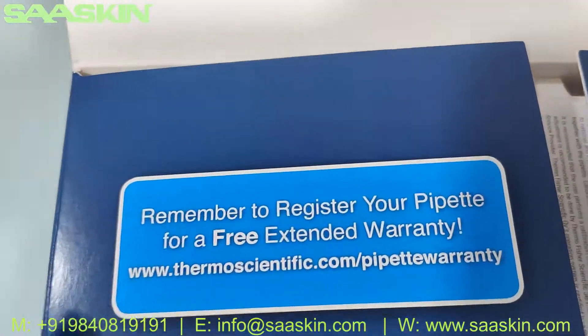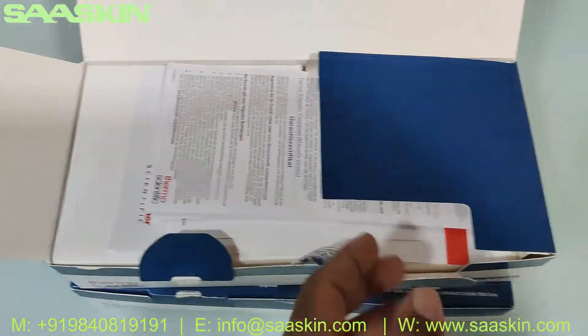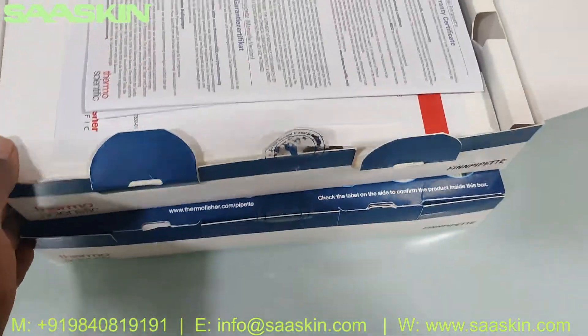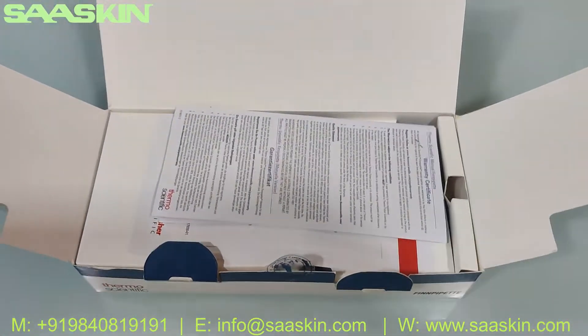It says: remember to register your pipette for a free extended warranty. When you receive this product, make sure you get it registered for your warranty coverage. Let me introduce the contents inside the box.